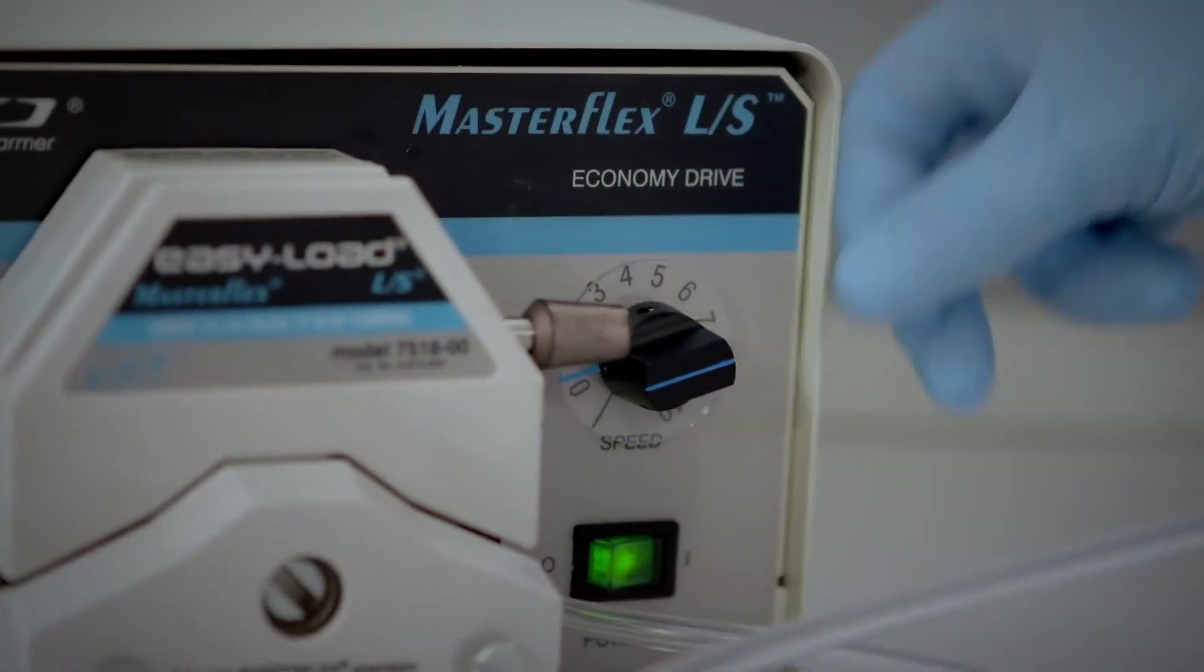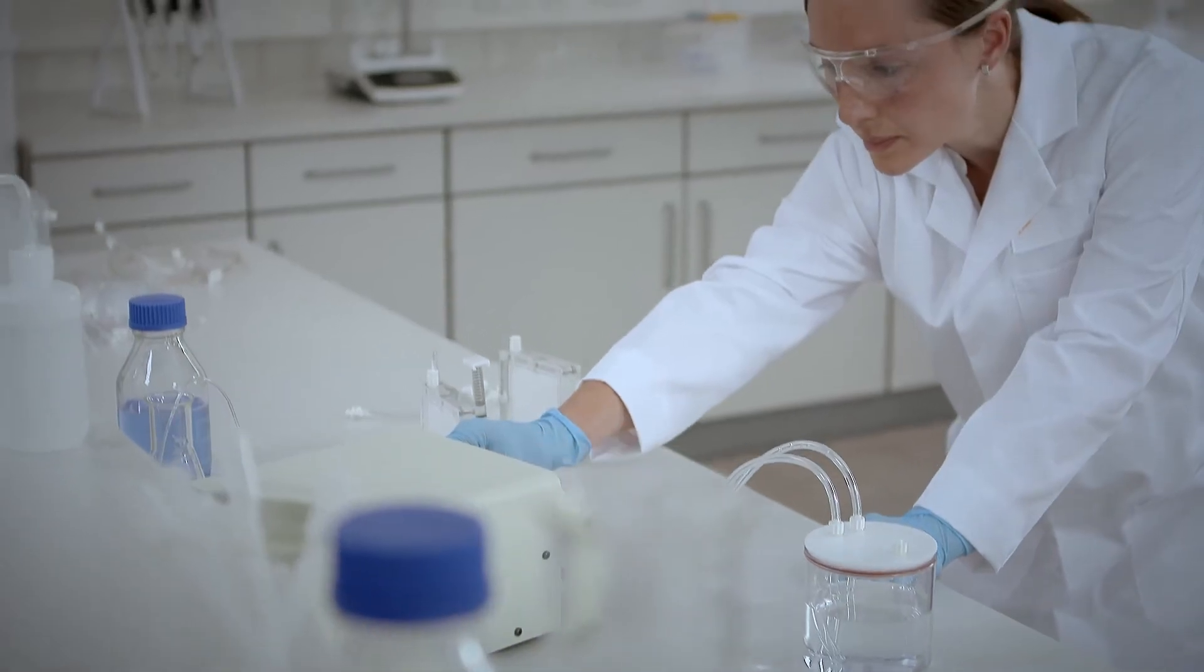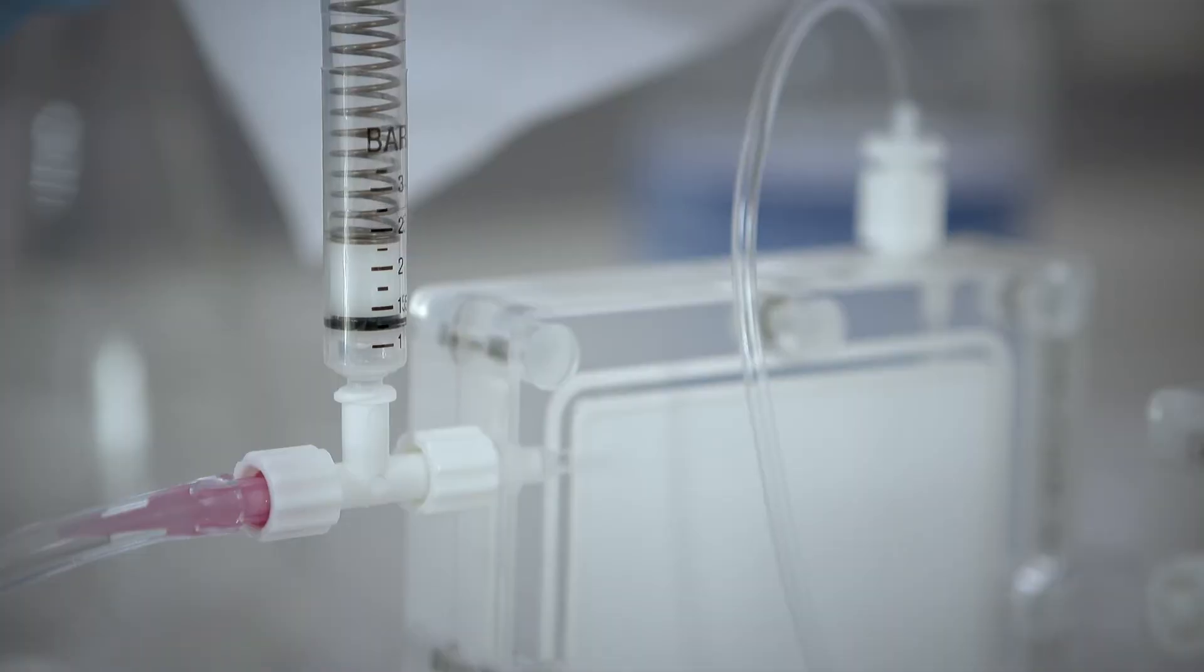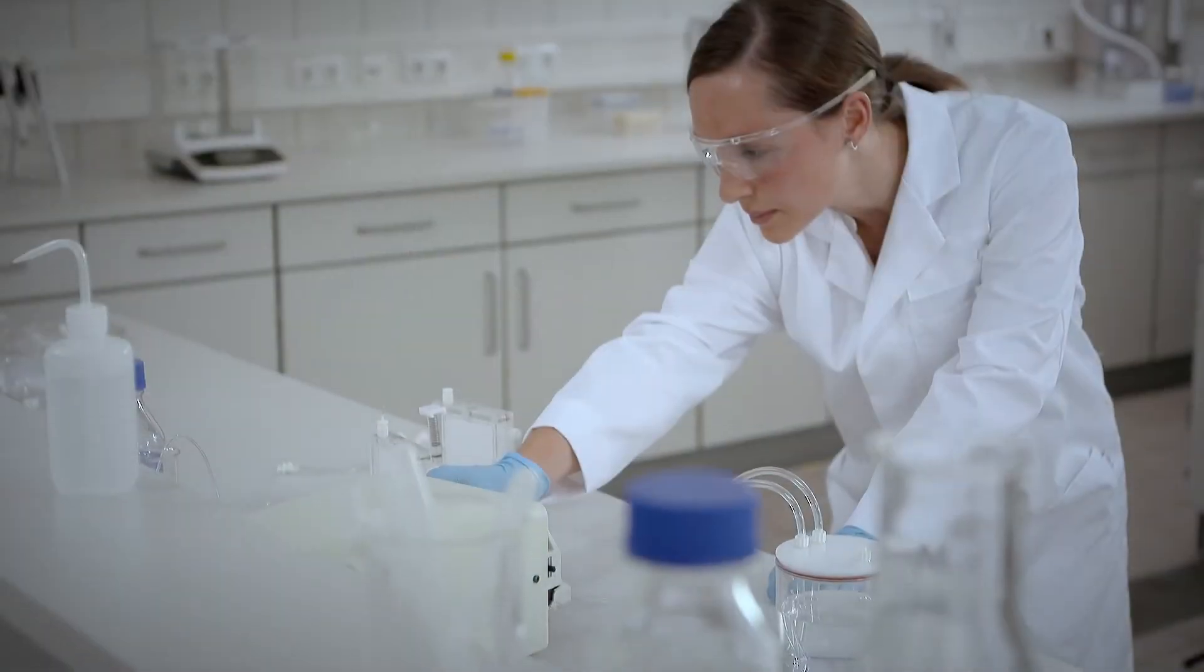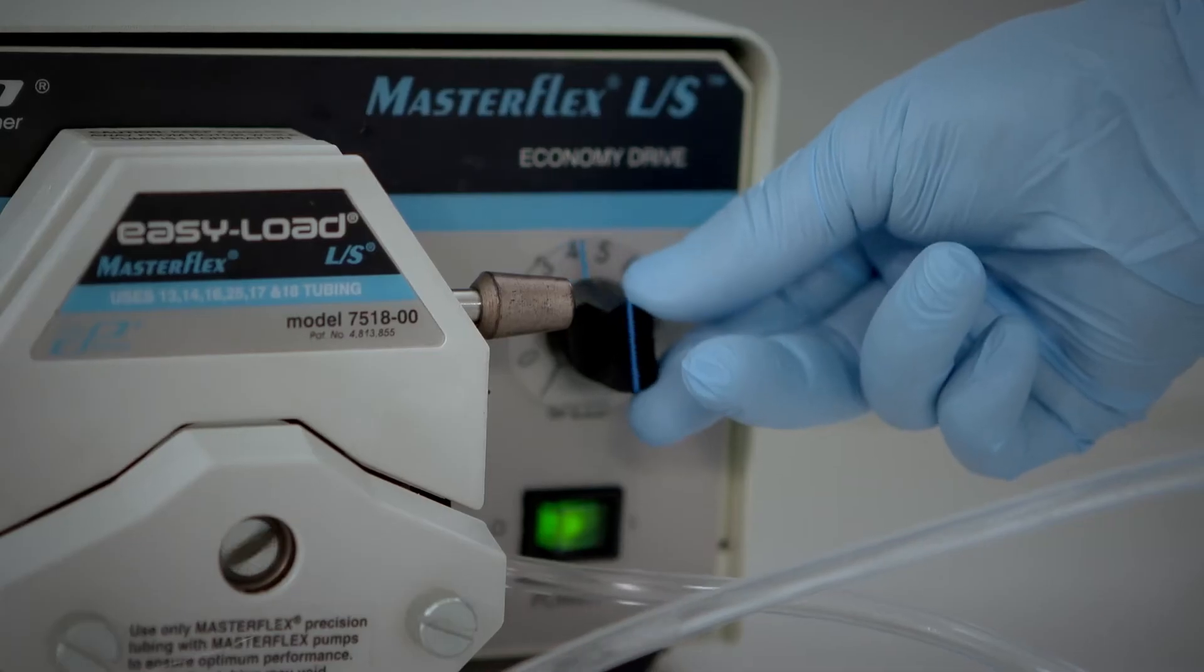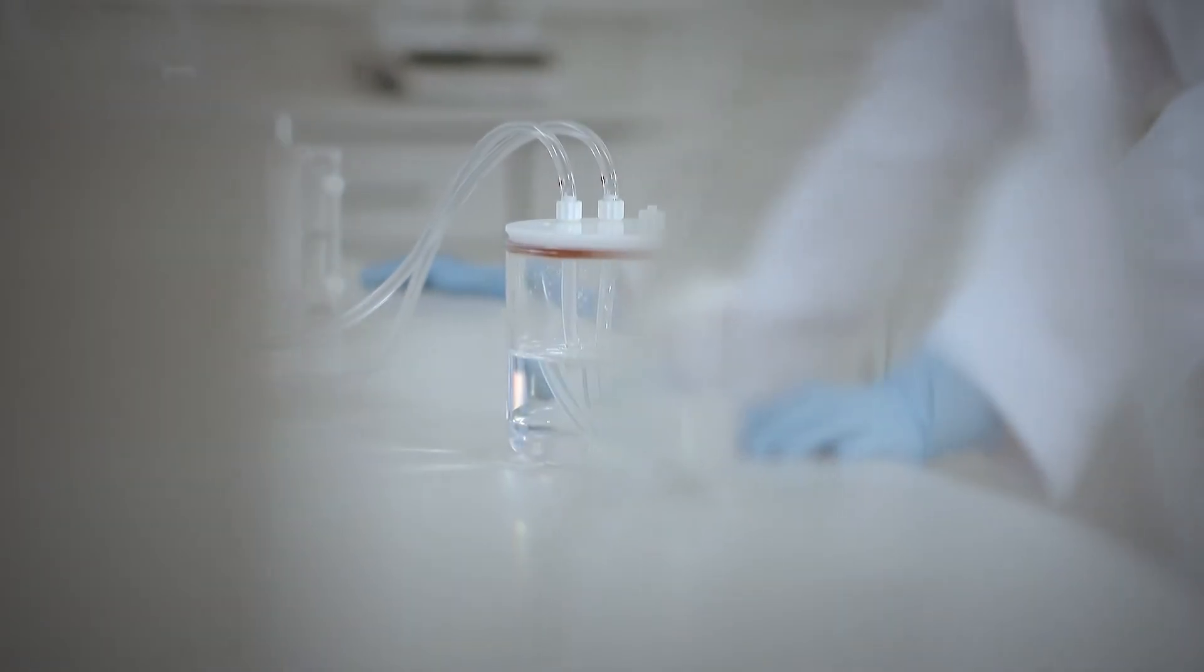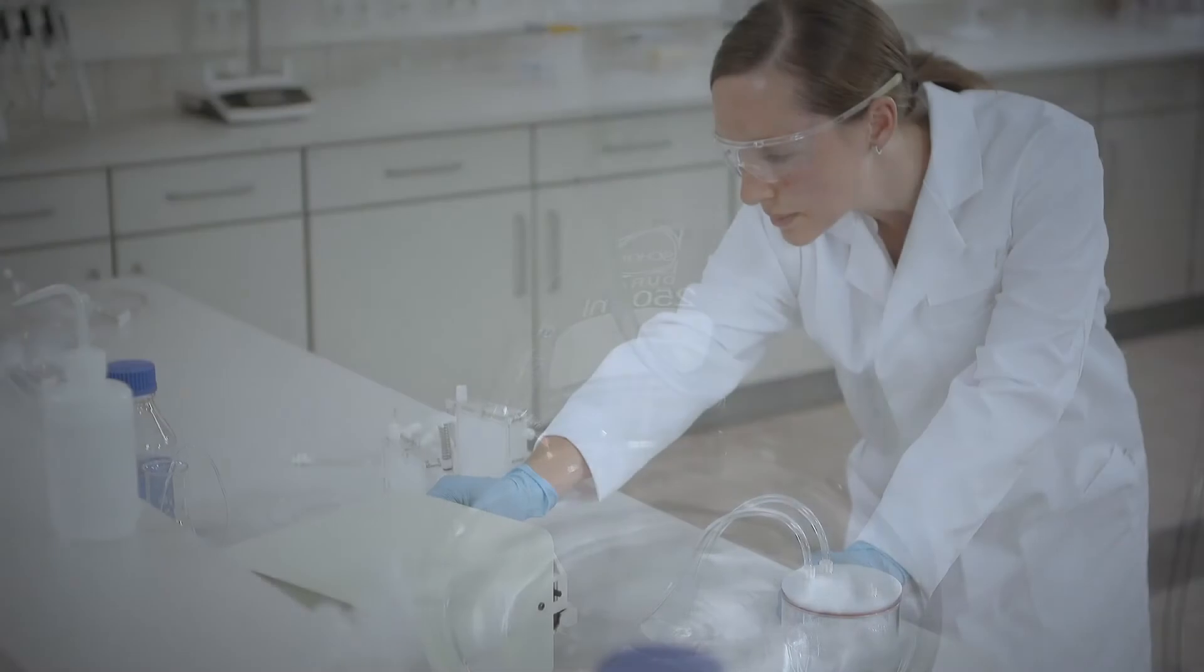Switch on the pump and slowly increase the pump speed up to a maximum pressure of 3 bar or 45 psi. As a rule, this pressure is reached after turning the pump speed to level 6 to 7. The concentration run has begun once filtrate starts to drip from the filtrate tubing into the filtrate collection vessel.